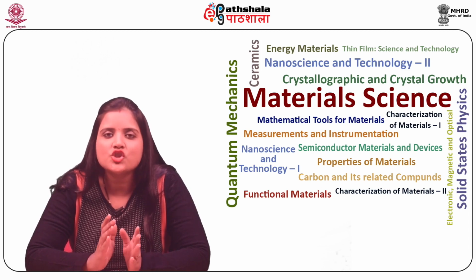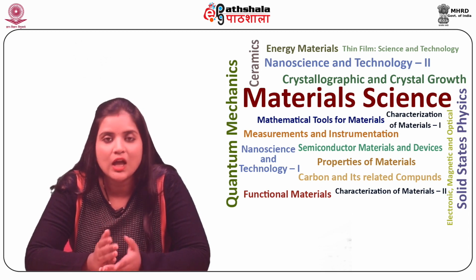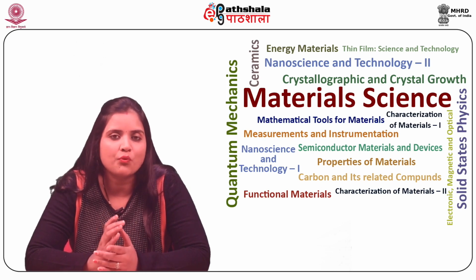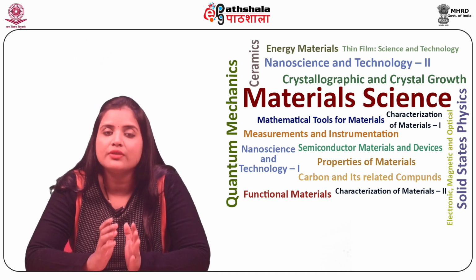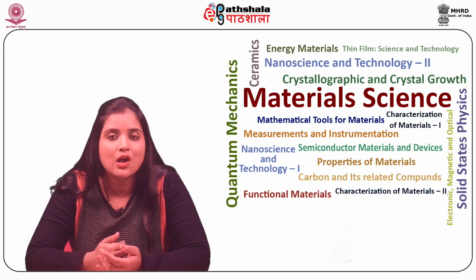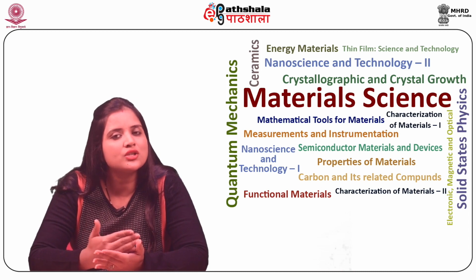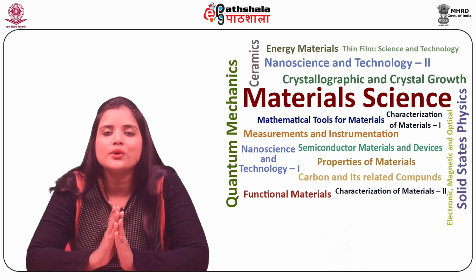Meng et al. chart the developments from film to digital chip-based holography for micro PIV experiments. In short, digital camera pixels needed to be sufficiently small to resolve micron-scale objects. These cameras needed to have sufficiently fast frame rates for video imaging, and computers needed to be powerful enough to reconstruct three-dimensional electromagnetic fields in a time scale that was deemed useful.